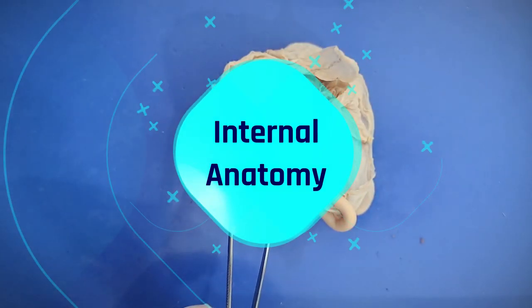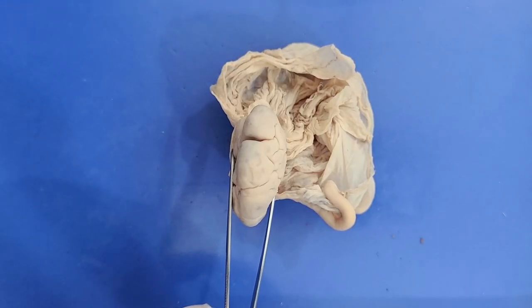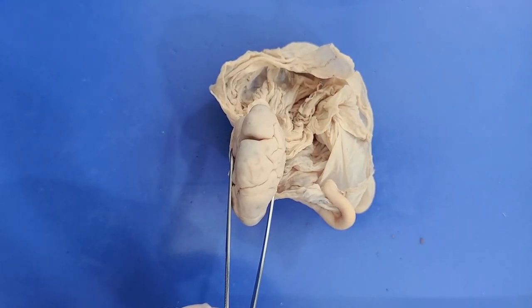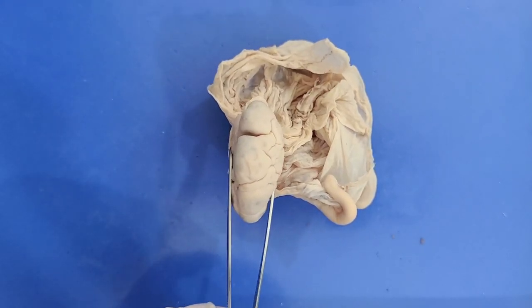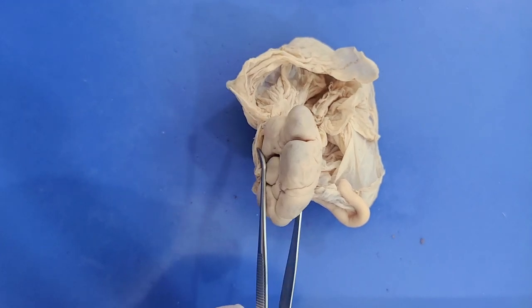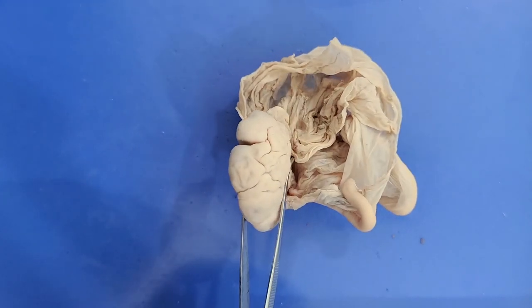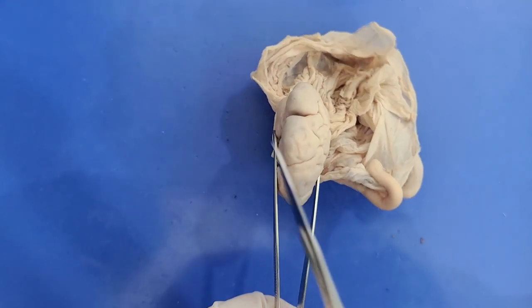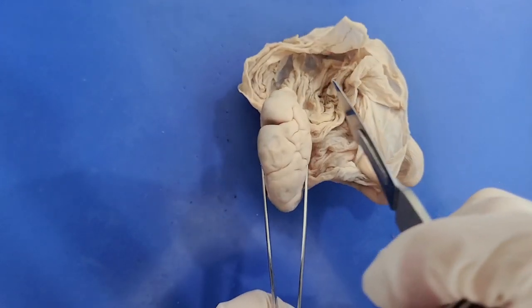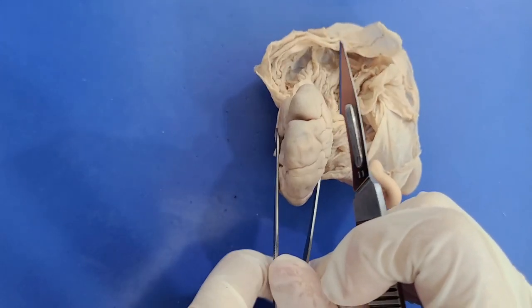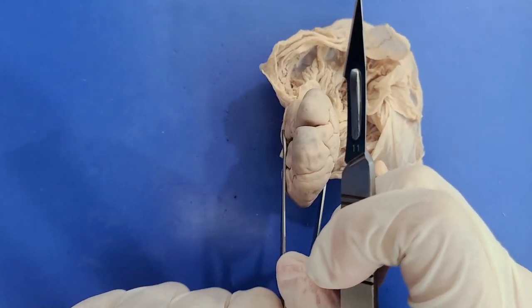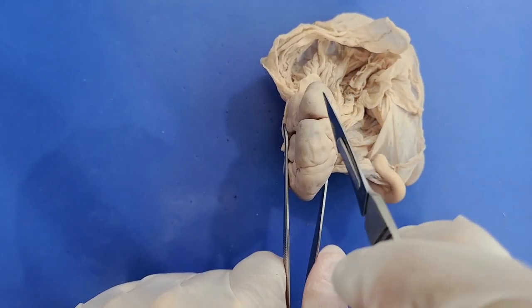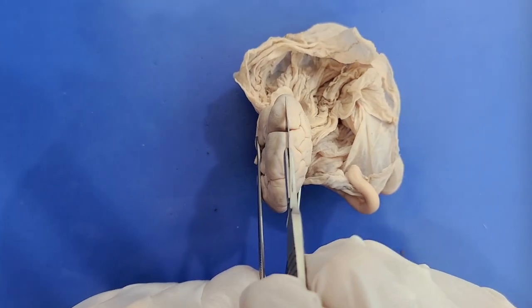Now let's get into the internal anatomy. I'm going to cut the ovary longitudinally — hold it steady, then take a scalpel and cut the stroma straight in half down the midline, then pry the sides apart.